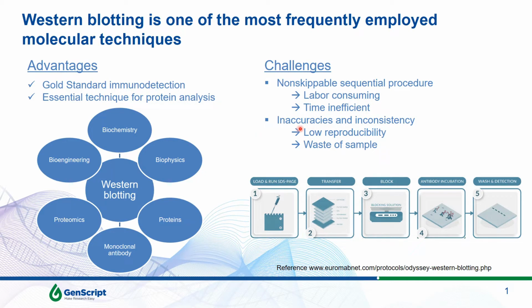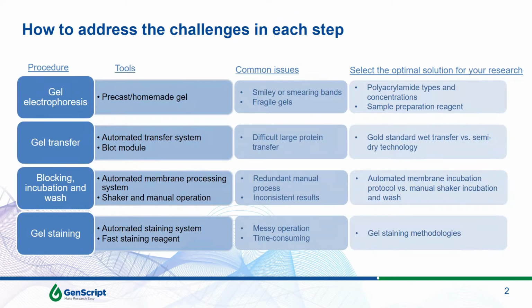And second, its inaccuracies and inconsistency associated with all the manual procedure, which causes low reproducibility in data and potential waste of samples. With that being said, how can we dissect the challenges and resolve them in each step is the project we all try to work on.